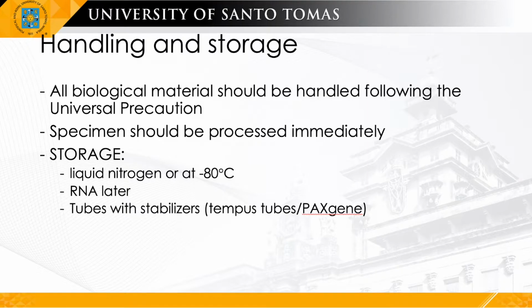First, all biological materials should be handled following universal precautions, meaning all biological materials should be considered infectious unless otherwise proven. Proper PPE and other safety controls should be observed by the laboratory technologist. Specimens should be processed immediately. When we talk about storage, it's best stored in liquid nitrogen or at negative 80 degrees Celsius.